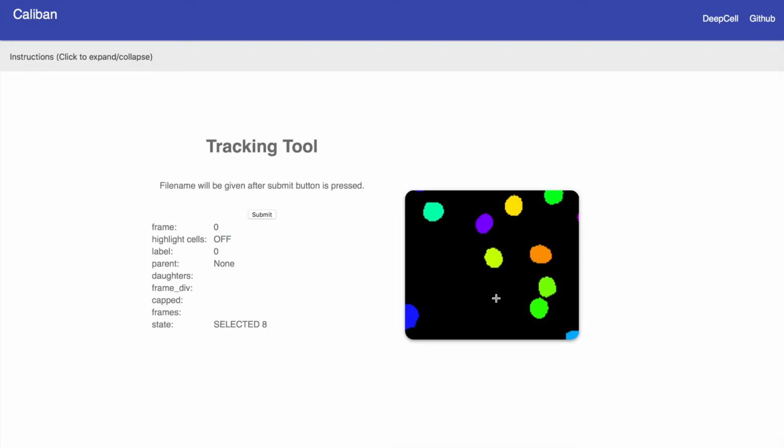If you want to undo your click and cancel the operation, click Escape or click on the black background. There is also a highlight mode option if you click H. If used, this will highlight the cells that are selected with a red mask.